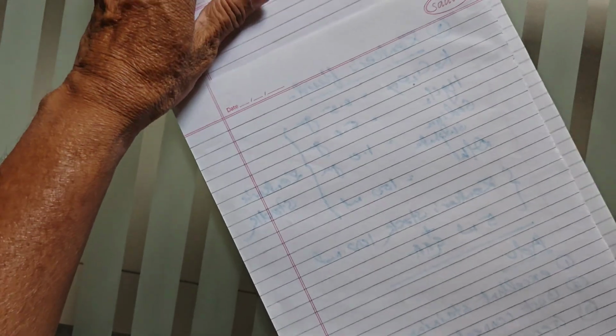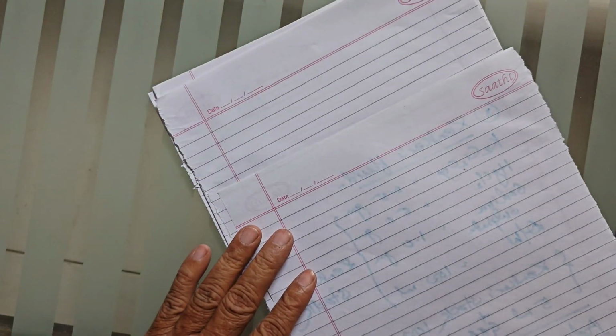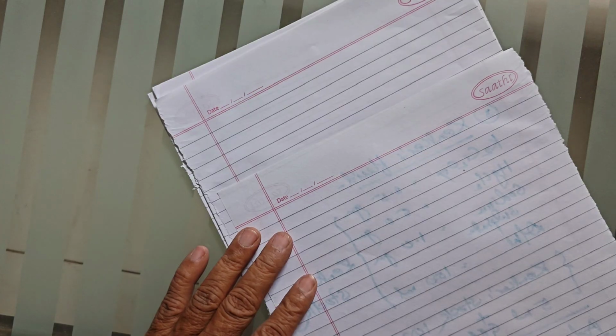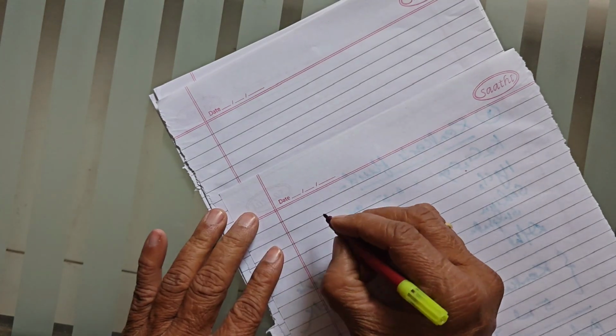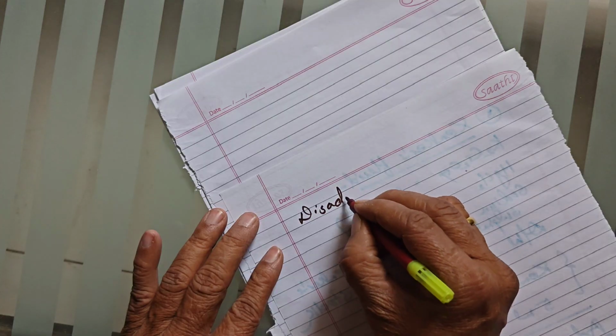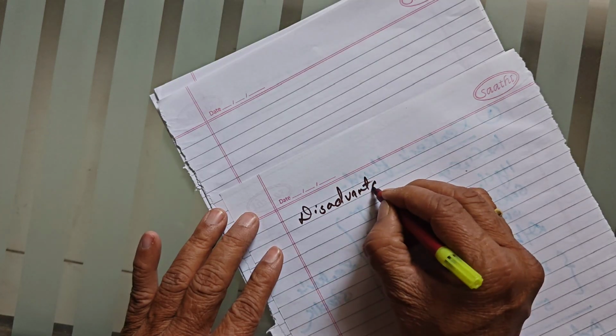Then this Zenker's fluid has a few disadvantages. Let us focus on the disadvantages of this fluid.